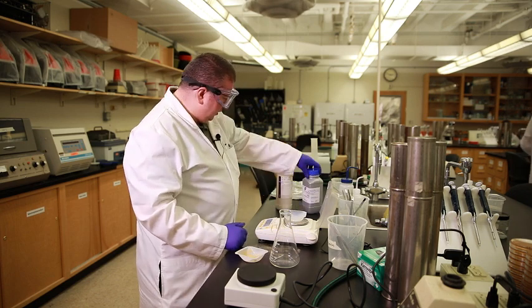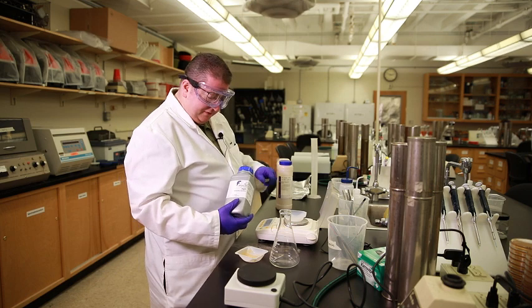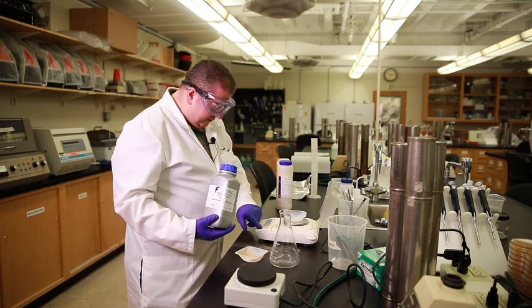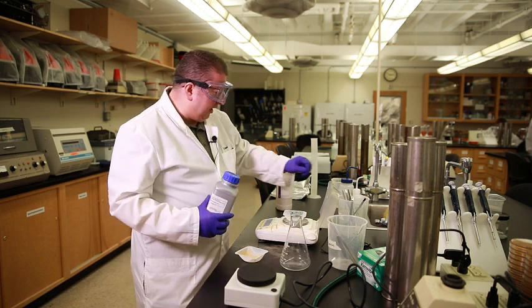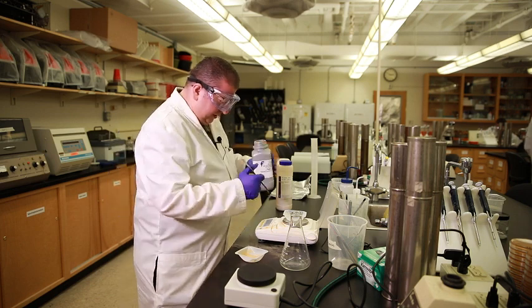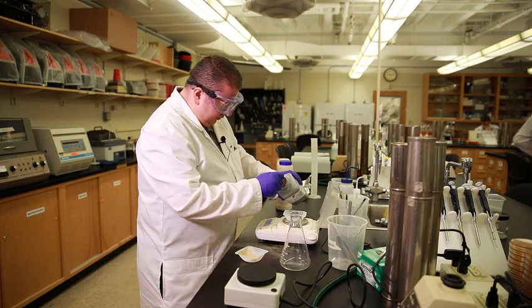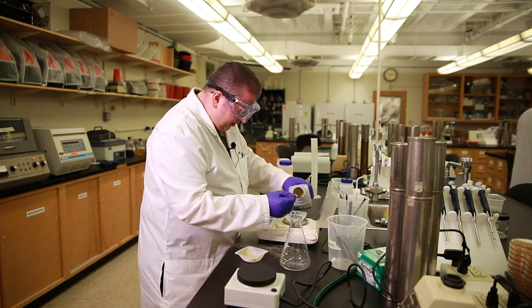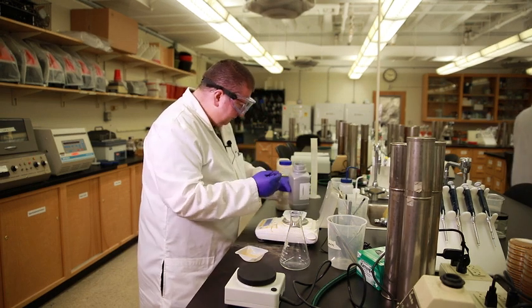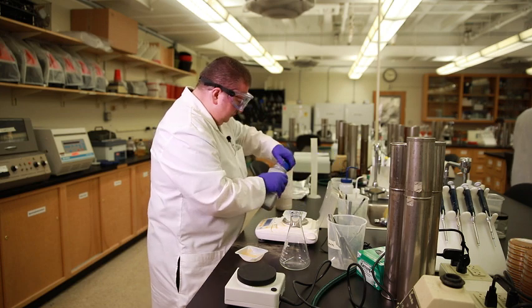Now I need to add the agar, which will then solidify, so that way the student is able to plate bacteria and get it to form colonies, which means we'll need about 5 grams of this agar. So grab another spatula, and then we'll weigh out our 5 grams. Okay, so we're good with that.